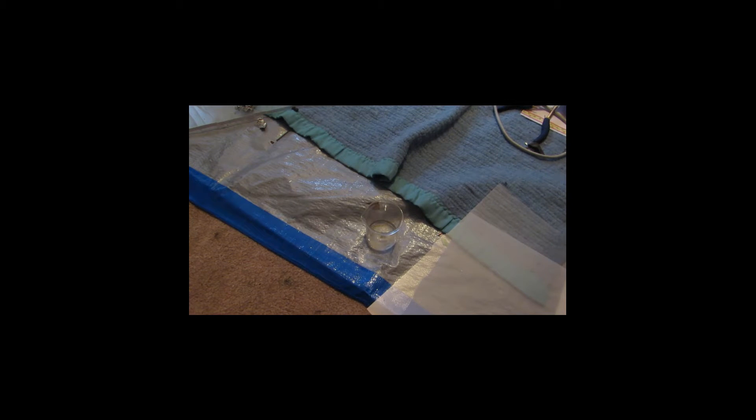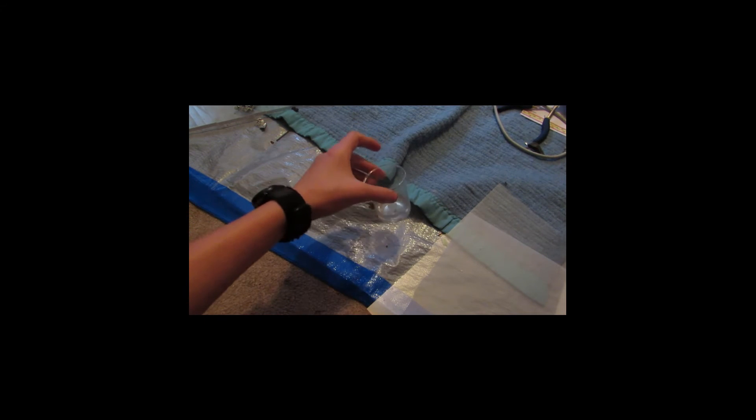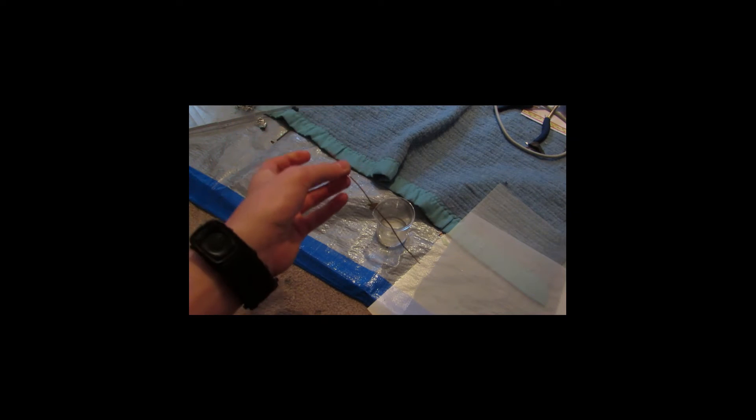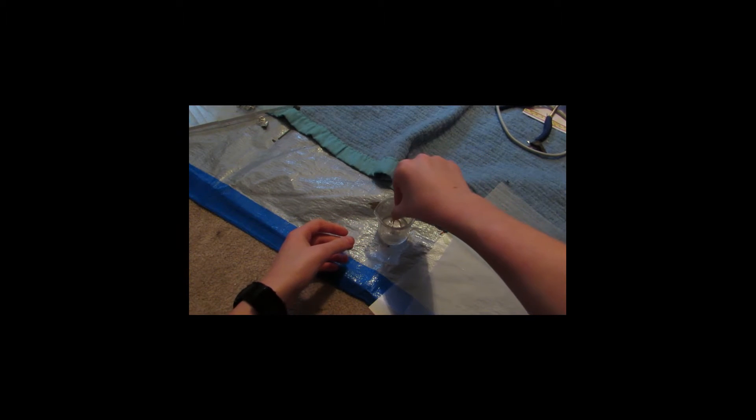Okay, so you can see we have it dissolved into solution here. Now that that's nice and dissolved, we're just going to want to take a small piece of copper wire, or pipe, or any form of copper that you might have, and we're just going to drop it in. I'm just quickly coiling it up so that we'll be able to grab it by the top here.